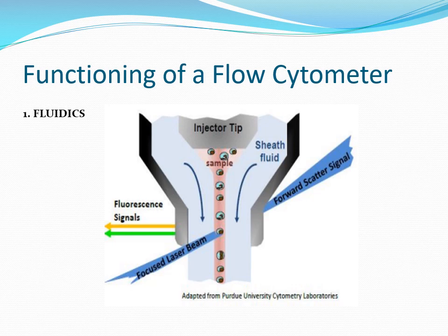For this purpose, saline solution is used. From the top, this solution goes down from top to bottom, making a directional flow focusing, as it creates a pressure, because according to Bernoulli's principle, when it flows down through the narrower part of the system, it generates pressure. It keeps a constant specific pressure, and under this pressure gradient, the cells move down in the form of a single file.